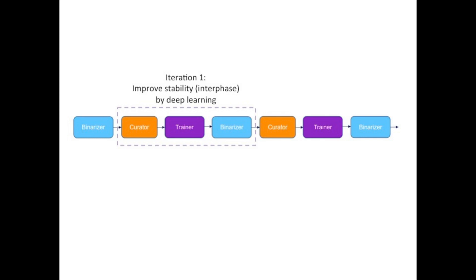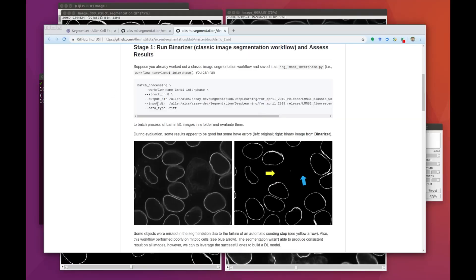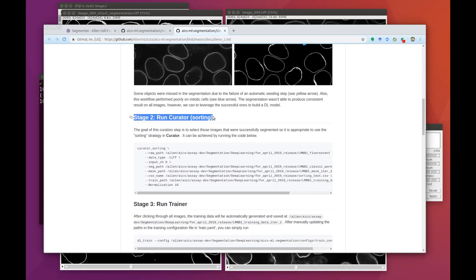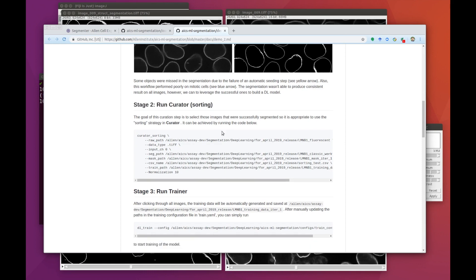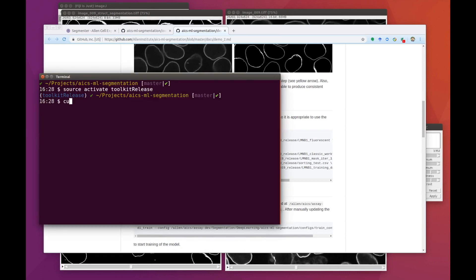Our next step is to create a proper training set by curating the current results, and use this curated data to train a deep learning model so that we can pick up Lamin B1 signals in every single interphase cell. We'll use the sorting curator to go through images and pick images that have good segmentation. If one image is almost segmented well with just a small area which is not good, the curator will allow us to keep it as a good segmentation and just exclude the small failed area from the training process. We call this an excluding mask. You can find more details in our documentation on our GitHub page.